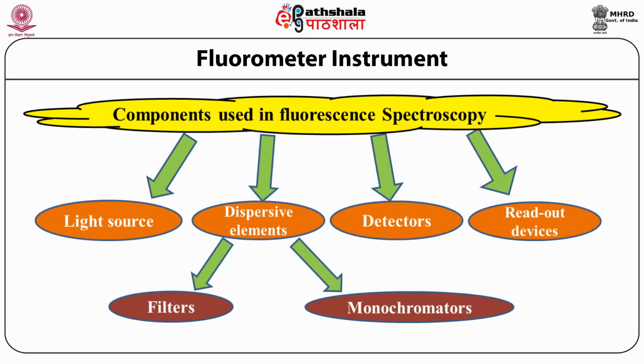There is a big challenge to control the wavelength provided by laser because that is so small, while the other way, the wavelength provided by the other sources such as lamps, mercury vapor, and xenon lamps is 200 to 800 nanometer range, which serves different functions for fluorescence spectroscopy.